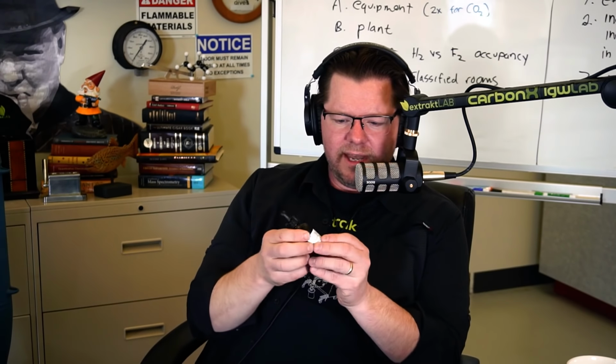I'll give you an example here. I made up a tincture. This would pass the test of the USP 467, which is the testing.